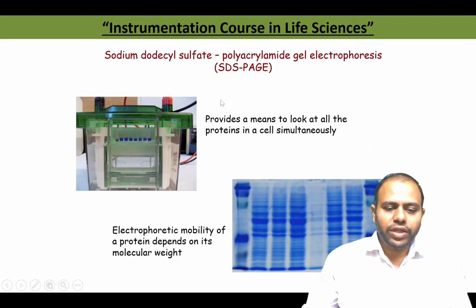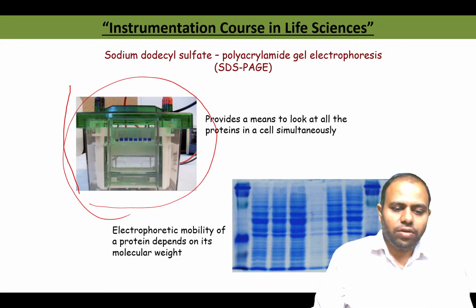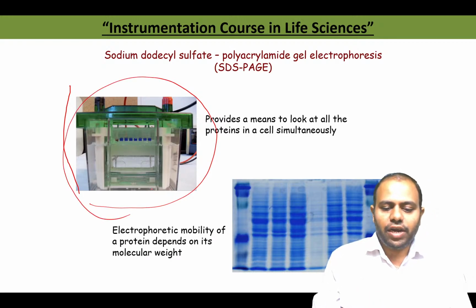You can see here a unit where SDS PAGE is being done. This is a vertical electrophoresis unit where the protein samples are loaded. This is the unit where the vertical electrophoresis happens.